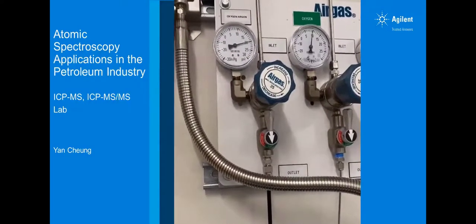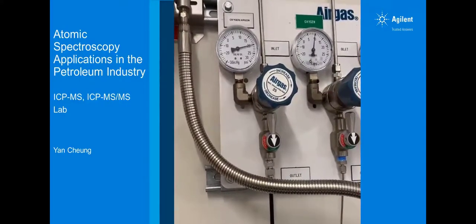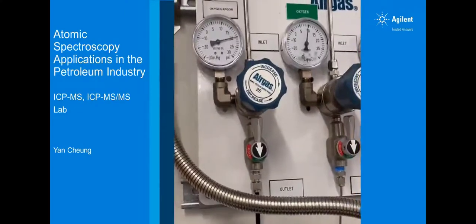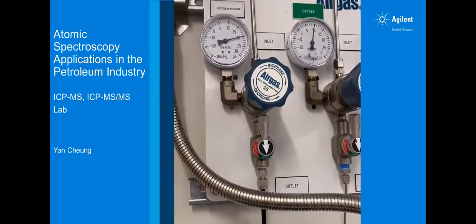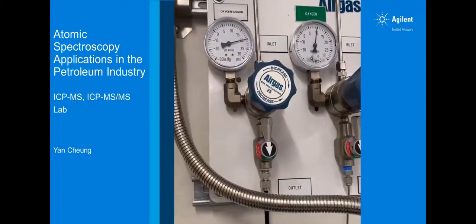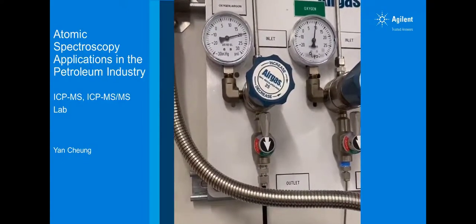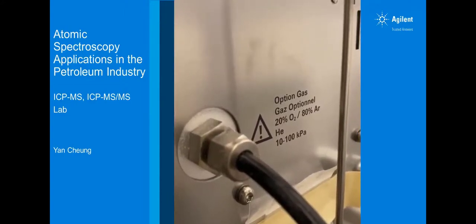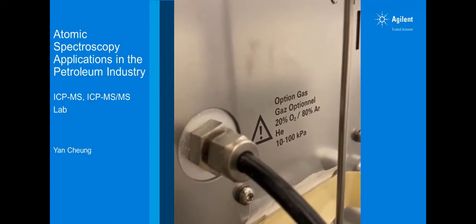Now first, you will need an oxygen and argon mixed gas plumbed to your instrument. Here I'm showing the gas inlet of the oxygen and argon mix, that it's 20% oxygen and 80% argon. This will plumb into the back of the instrument. Here I'm showing the optional gas inlet from the gas outlet to the instrument.